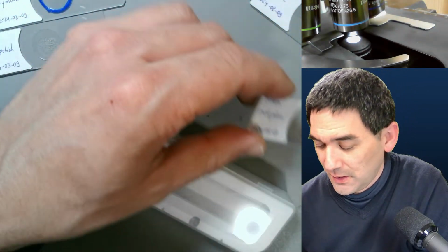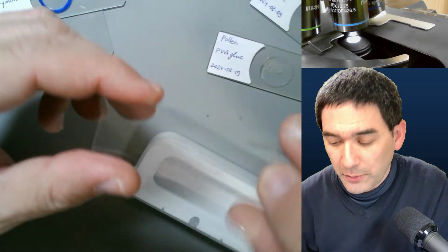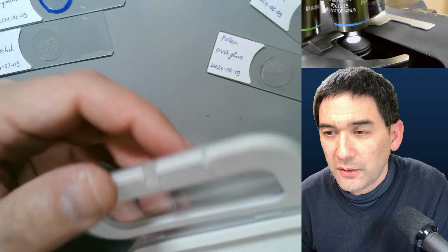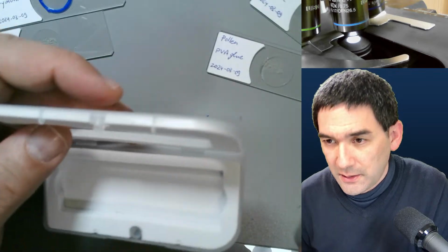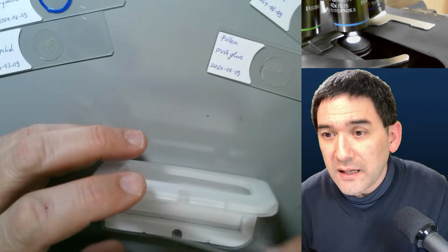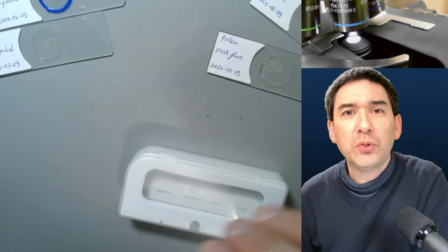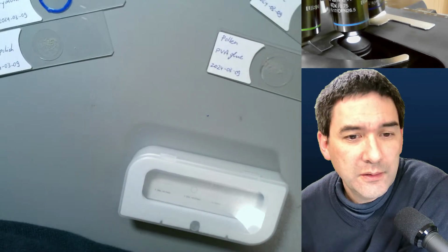Okay. So this was basically the micrometer slide, and what I would like to do now for the next 15 minutes or so... basically, imagine having a pointer with a scale on it. That's actually a cool idea.